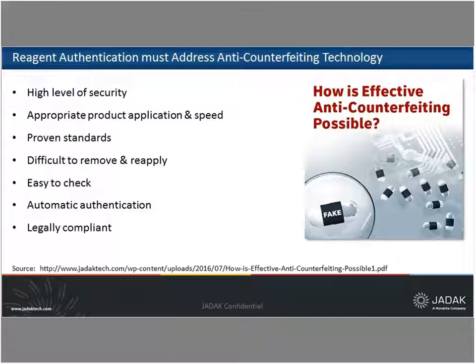Getting to the previous slide, where line of sight really isn't necessary with RFID, unlike barcode technology. There are some integration details that you do want to be aware of, and we'll talk about those a little bit later, but since it's not an optical technology, you don't have to worry about seeing the tag. And you want something that is easy to check and provides automatic authentication both during manufacture and clinical process.